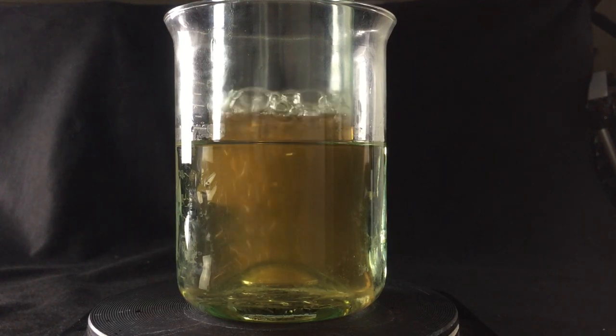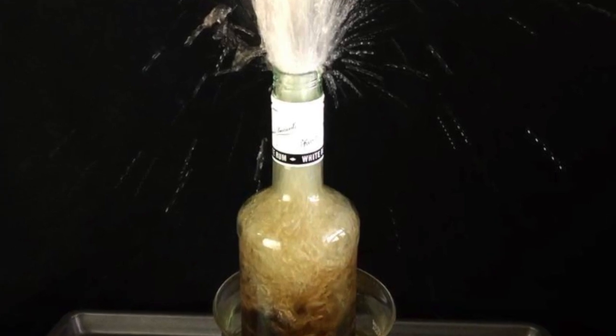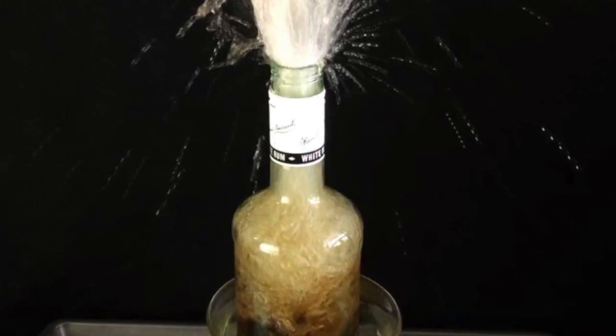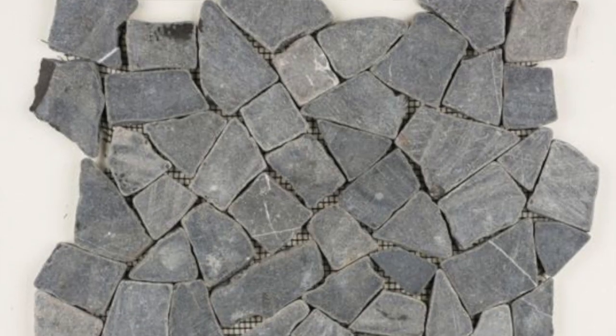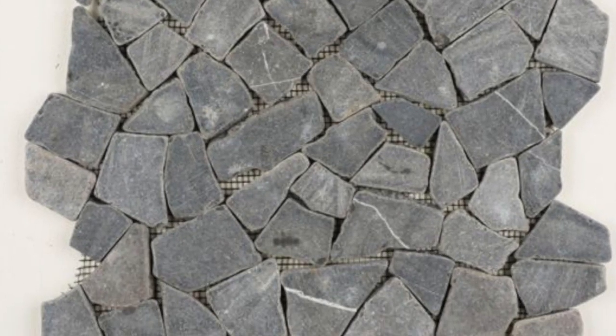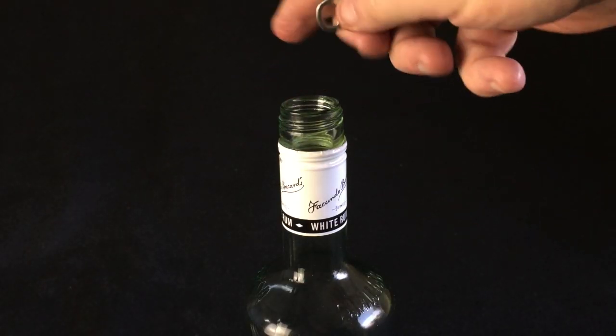Why? Because, as I'll demonstrate in a minute, bad things are certain to happen if the liquid in your bottle boils over. One very simple way to keep that from happening is to use boiling chips. Anything that has a rough surface and that won't interact with whatever you're heating should work. Pottery chips are a citizen scientist favorite. However, if the solution doesn't react with aluminum, you can just drop in a few pop tops from aluminum cans.